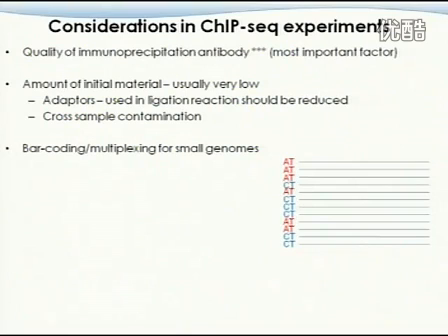So you can see, for sample A, you put AT there, and for sample B, you put CT there. And after that, you mix everything together. Probably you'll put 2 samples there, and you sequence 100 million reads, and each sample is roughly 50 million reads. And then how you decipher that, you just look at the first 2 letters of your sample, and you'll have a good idea which fragment is from which sample. So this is called the barcoding or multiplexing protocol.